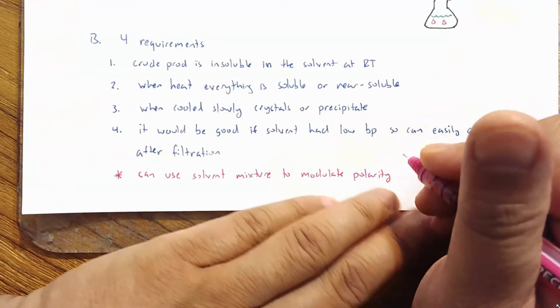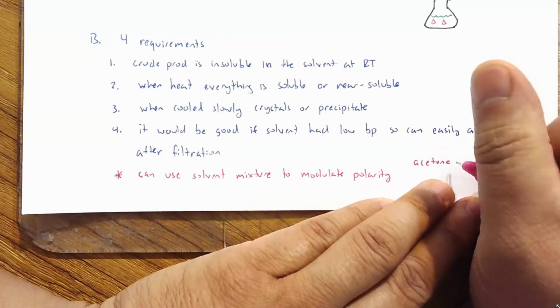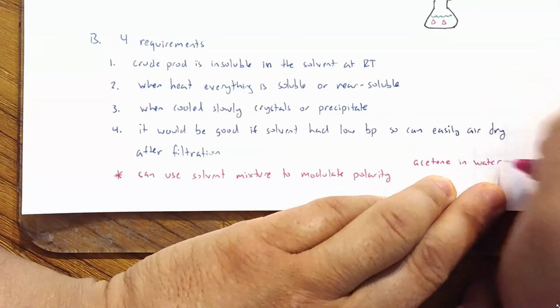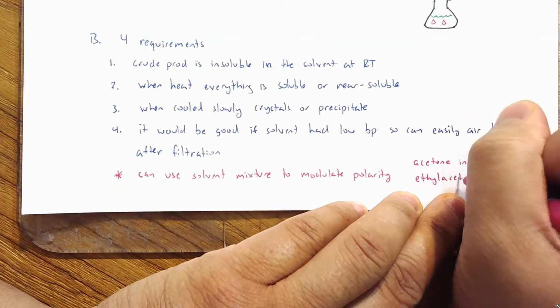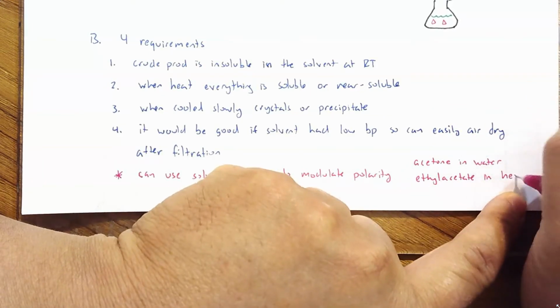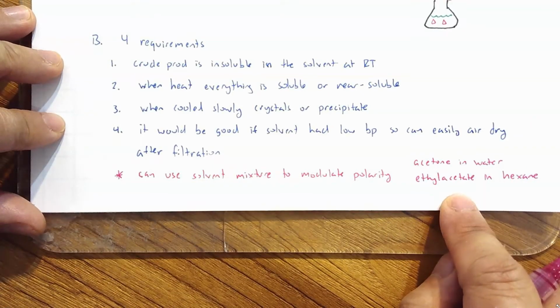Some ideas could be something like acetone. There are some mixtures that I've used in the past. Acetone in water, okay, mostly water, and then also ethyl acetate in hexane, and in this case also mostly hexane, a little bit of ethyl acetate.